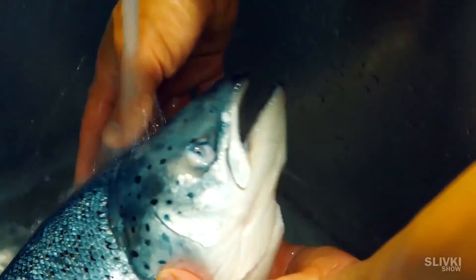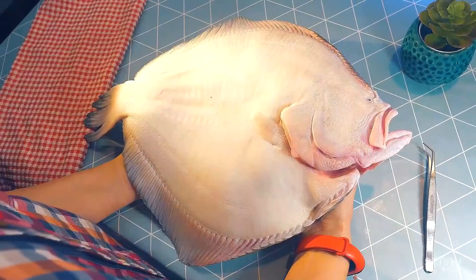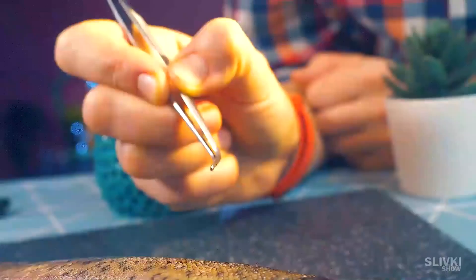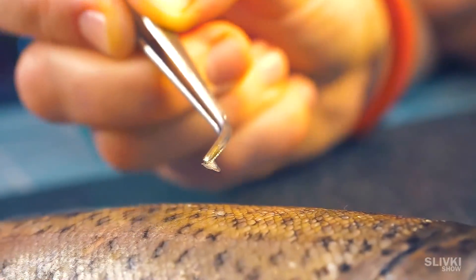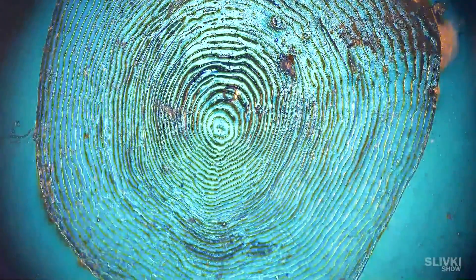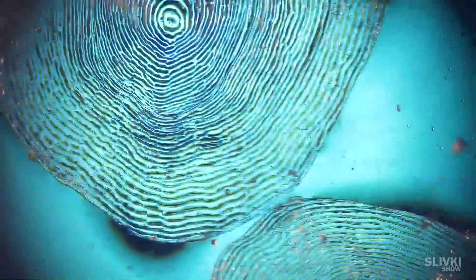In the last video, we were not able to look at the scales of a fish because our fish was scaleless. We want to remedy this situation, and this time we bought a fish with scales. Using tweezers, it was surprisingly easy to get the scales out. Under magnification, we see these transparent plates with grooves around the edges, which are very similar to the fingerprint of a person.